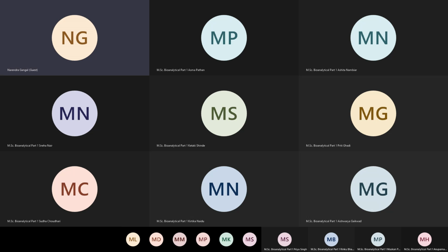Suppose I want to analyze atoms like sodium or potassium. These cannot be analyzed by normal mass spectrometry, because all the other things we discussed, EI, CI, thermospray, are for organic mass spectrometry, not for inorganic. So ICP is the technique we are going to discuss, a source for analyzing inorganic samples. I will share the screen.